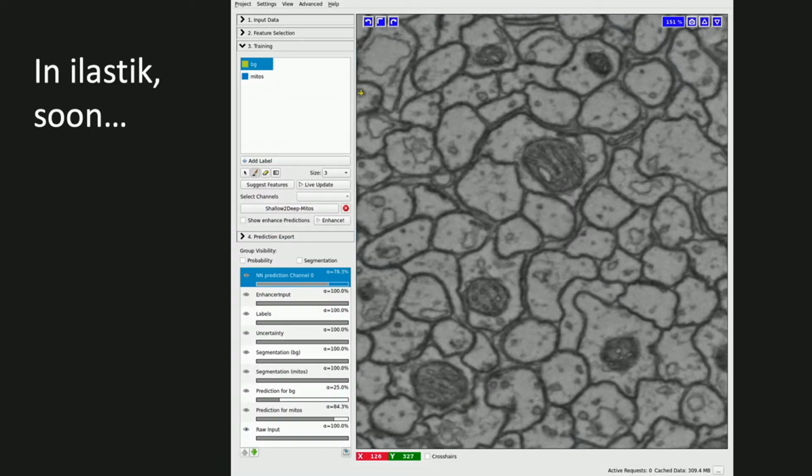Yeah, so this approach is so well compatible with the Ilastik annotation model that this is something that we hope to actually bring out to you soon. We hoped to tell the organizers of the Swiss Image Analysis School ZIDAS that we will have it there, and this is early July, so really soon. And this is already a prototype, you can see. The way we imagine this will work is that you will just have this one little additional menu here for getting a pre-trained network in. And then you give your labels like you usually would in Ilastik. And so this is very few labels.